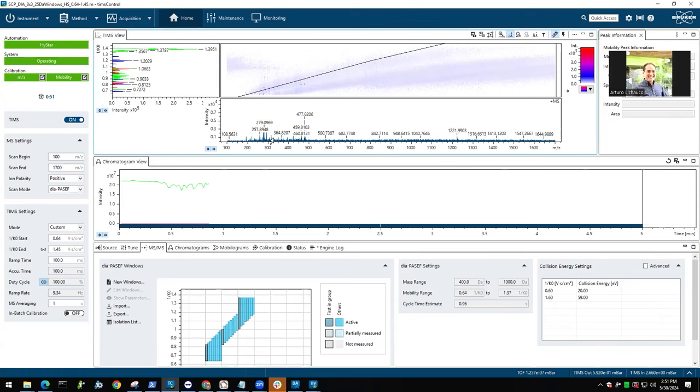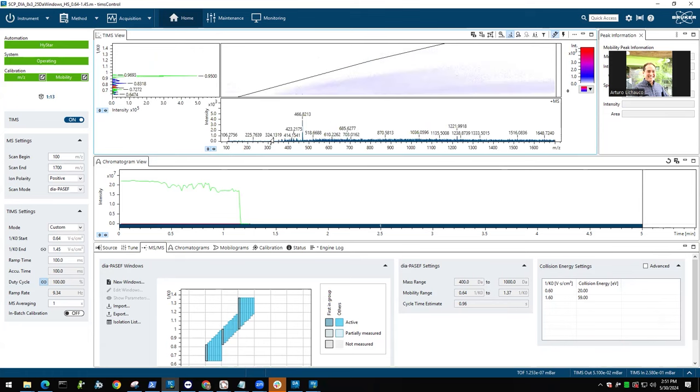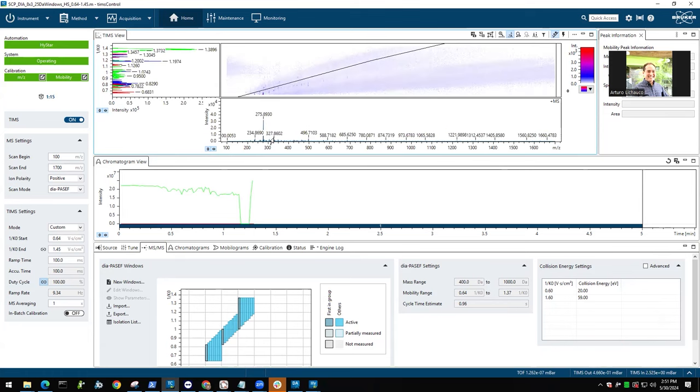So right now, what we do here is we have our source. Our column sits here. It's basically closed, and we only draw air in through this filter here. And you can see when I put my finger on it, nothing will happen because now there's a vacuum inside and there's no spray. Take my finger away, the signal comes back.